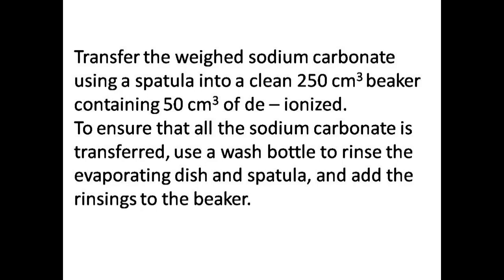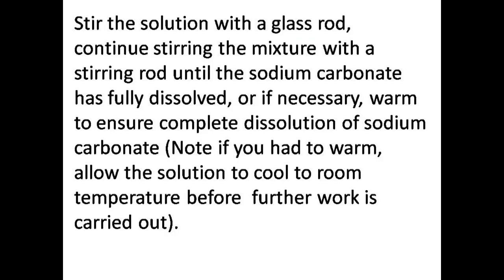To ensure that all the sodium carbonate is transferred, you use a wash bottle to wash the evaporating dish and the spatula, and you add the rinsing to the beaker. Then you stir the solution with a glass rod. Continue stirring the mixture until the sodium carbonate has fully dissolved, to ensure complete dissolution.